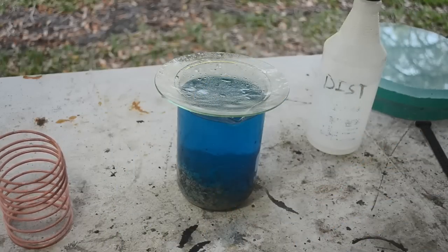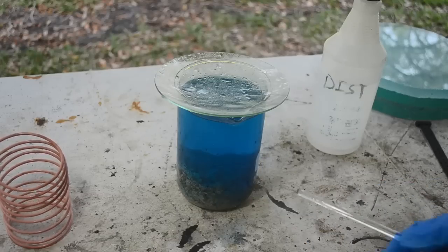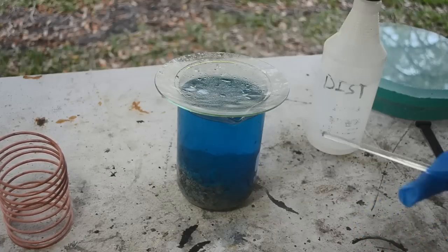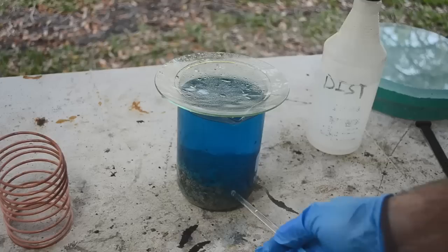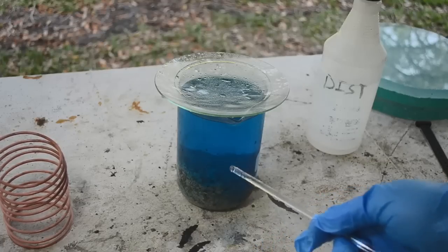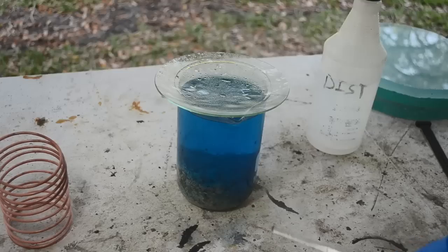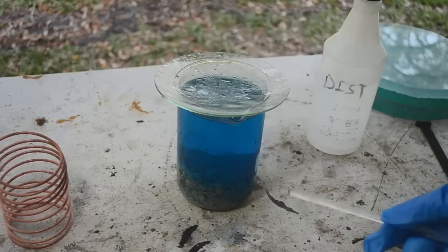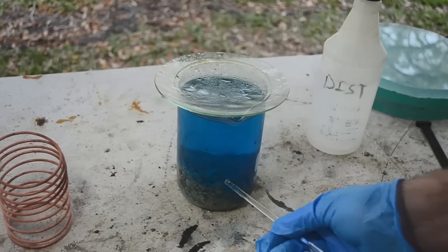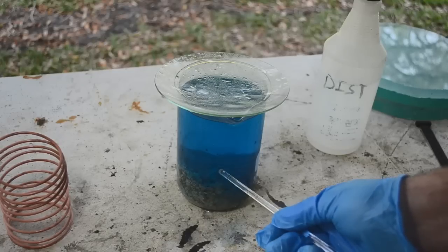But you know, the more I think about this, the more I think that the sulfuric acid may not be a great idea. I'm gonna go with dilute sulfuric acid because I'm worried that more concentrated acid, especially if it's hot, will dissolve a lot of the silver. And you know, it's gonna negate any advantage I get just by cleaning the copper out of this and the losses in silver. So I think what I'm gonna do is I'm gonna go with probably cold or at worst not very hot dilute sulfuric acid.